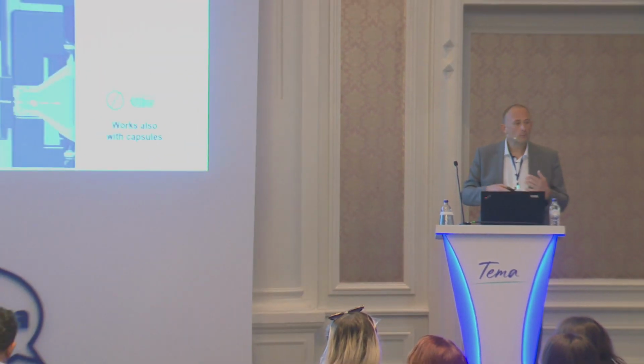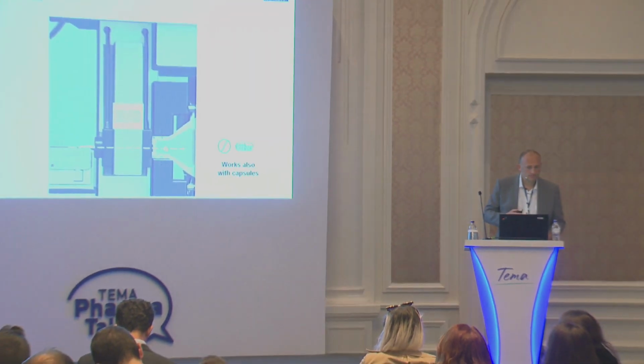And this is what we record. We have the 0 state, we have then the changed state, and this difference is what we record. What happens? The microwave interacts with the dipole of the molecules, and this is the reason that they will be changed. Next position, the tablet or the capsule is leaving the chamber. So the fields are re-established to the 0 state, and they are waiting for the next tablet to be measured.